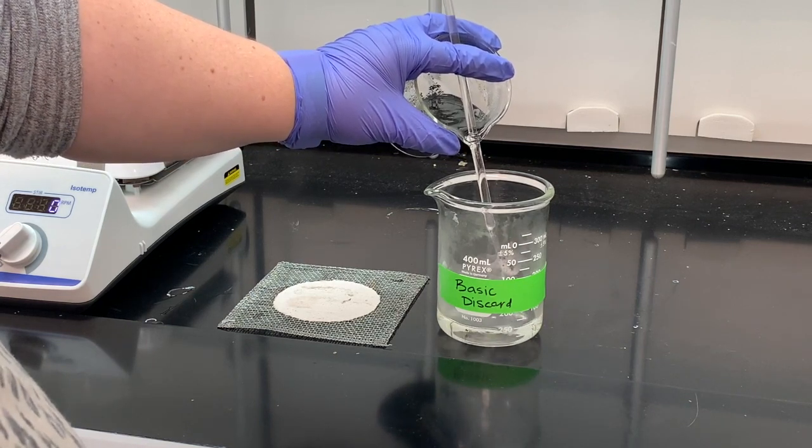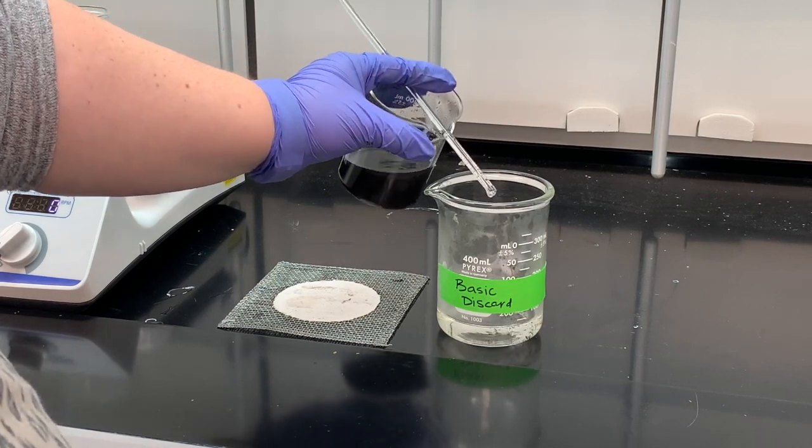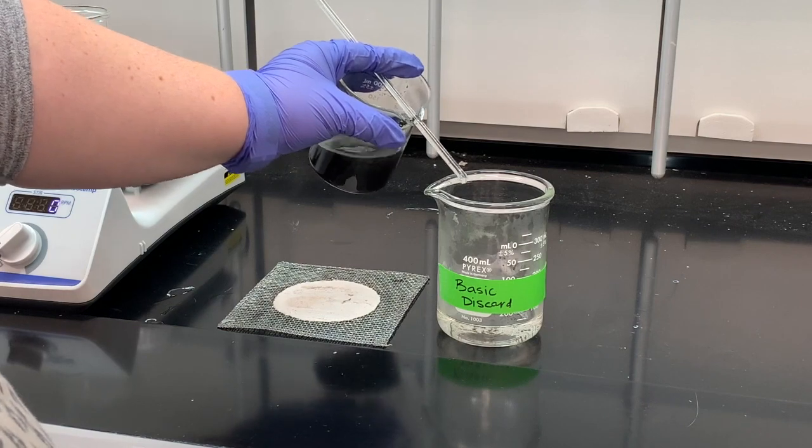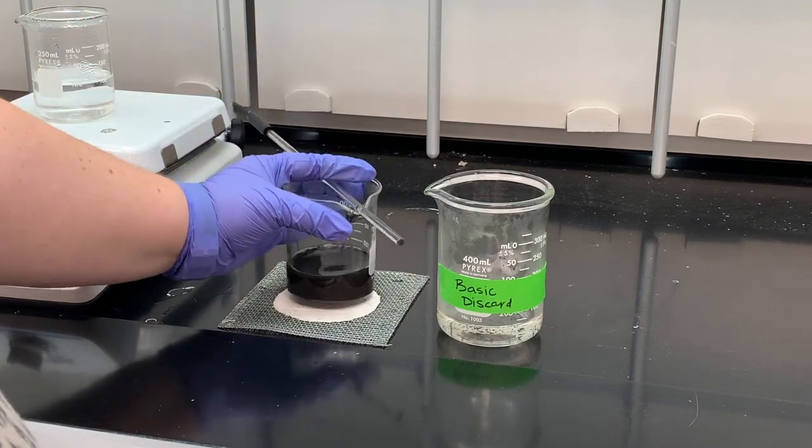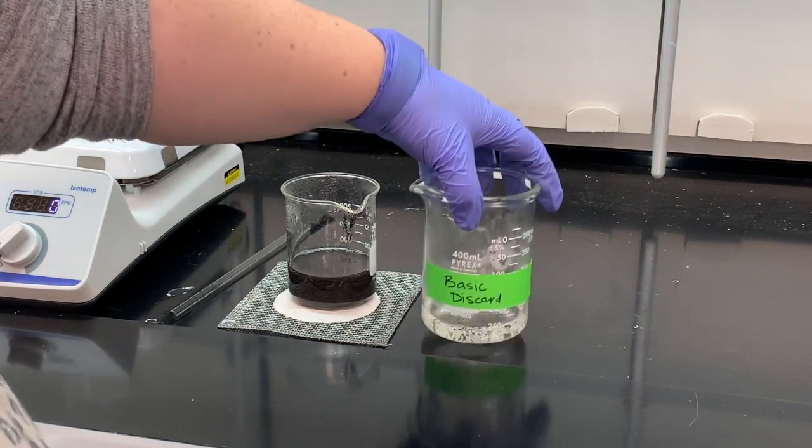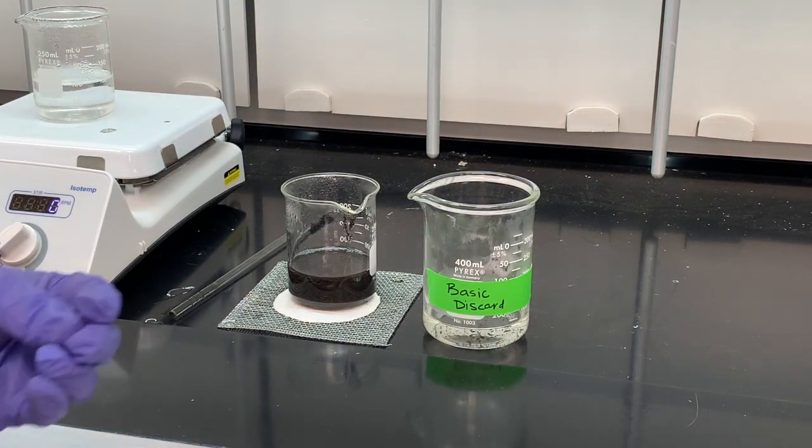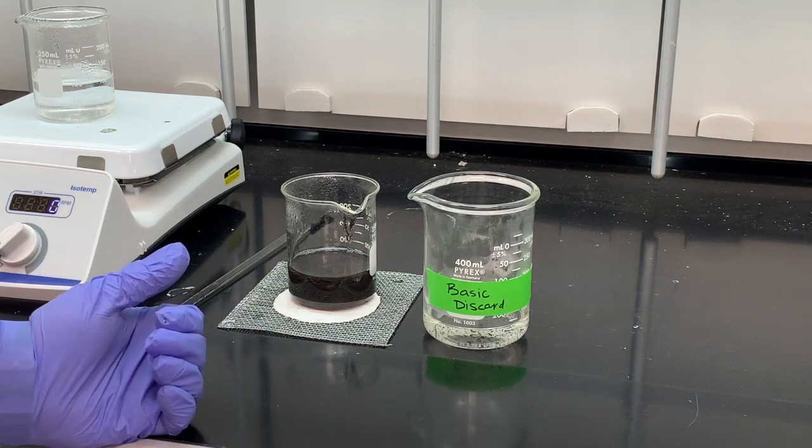And we're not going to be able to decant to dryness. So I started seeing some of my black solid start coming out, so I'm going to go ahead and stop decanting. And in my waste beaker I did get a little bit of solid.